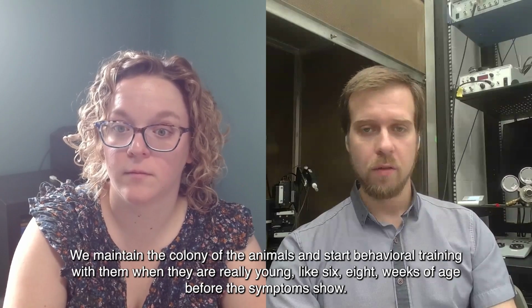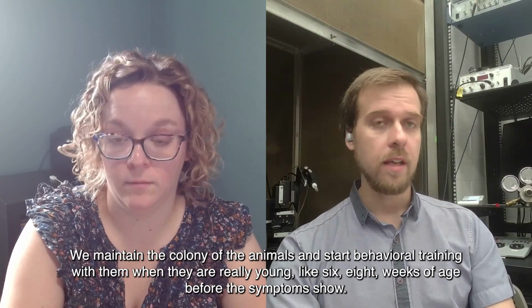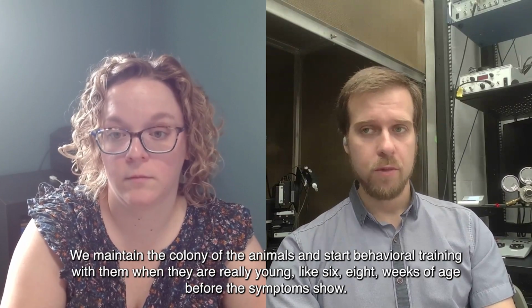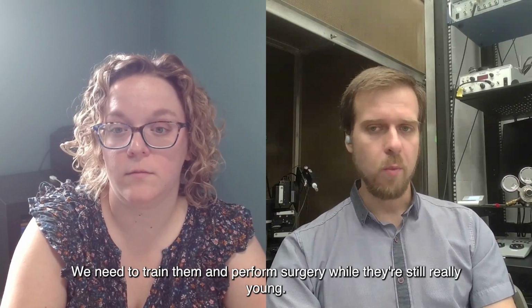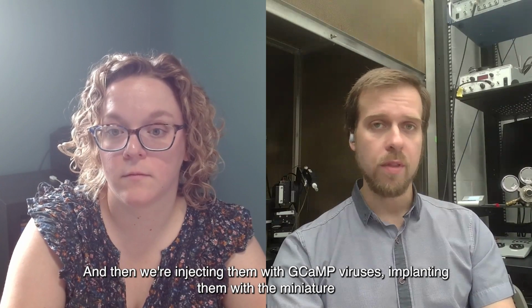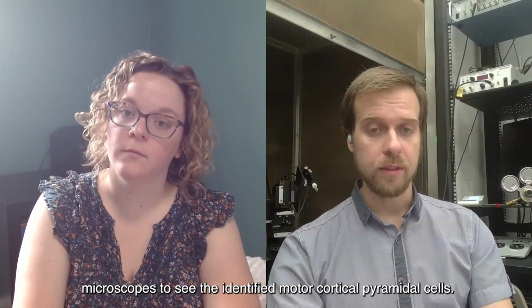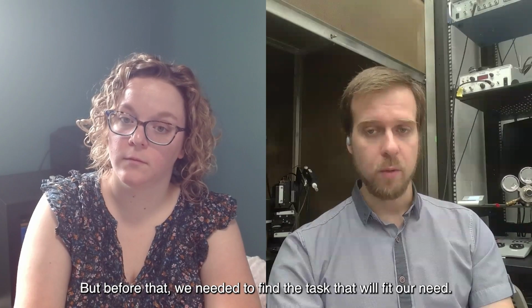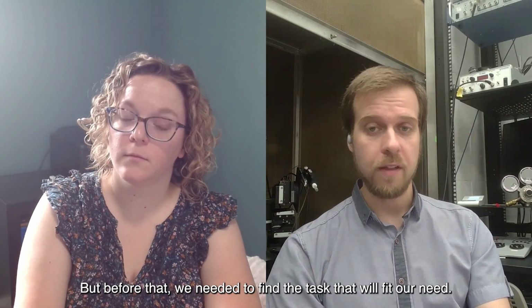We maintain the colony of the animals and start behavioral training with them when they are really young, like 6, 8 weeks of age, before the symptoms show. We need to train and perform surgery while they're still really young. And then we're injecting them with GCaMP viruses, implanting with miniature microscopes to see the identified motor cortical pyramidal cells. But before that, we needed to find the task that will fit our need.